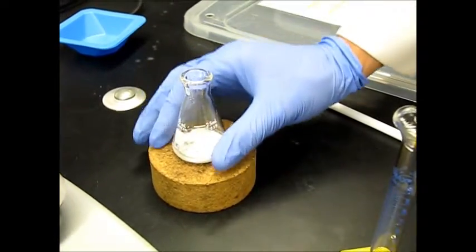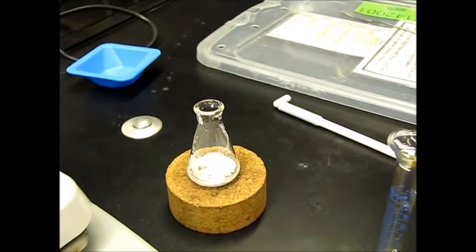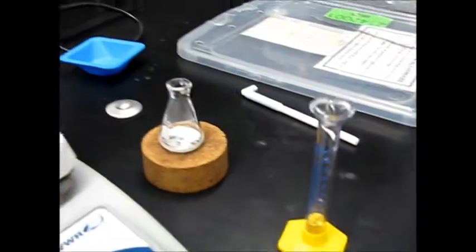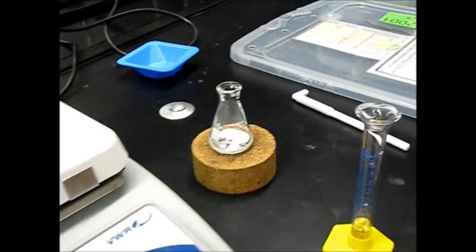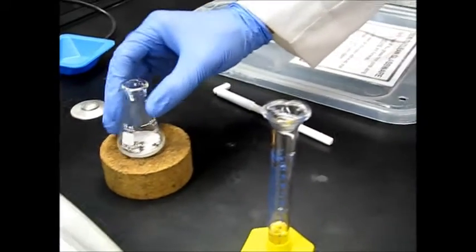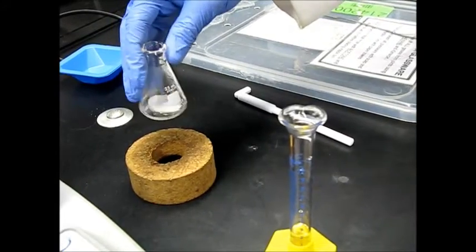So this next part, we're gonna allow it to cool down a little bit more. We still have some excess sodium borohydride left in the solution, and we don't want that in here. So the next part, we're gonna take this reaction flask to the fume hood. We're gonna add a little bit of 3 molar hydrochloric acid. That's going to react with the excess borohydride and get rid of it as H2 gas. So we will see gas evolving. So that's why we're going to be doing it in the fume hood.